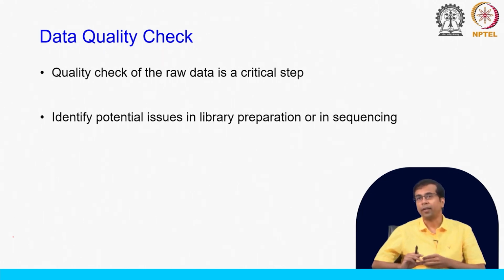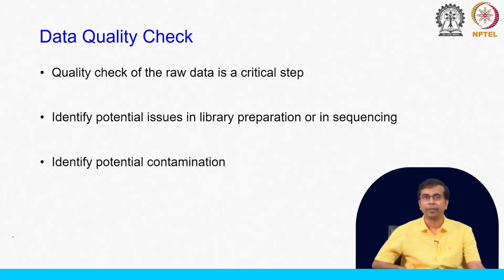In some cases you might have some issues with the sequencing process itself. There might be some sort of issue with the adapter ligation, etc., and the sequencing process did not work for whatever reason, and those will be identified at this step as well.